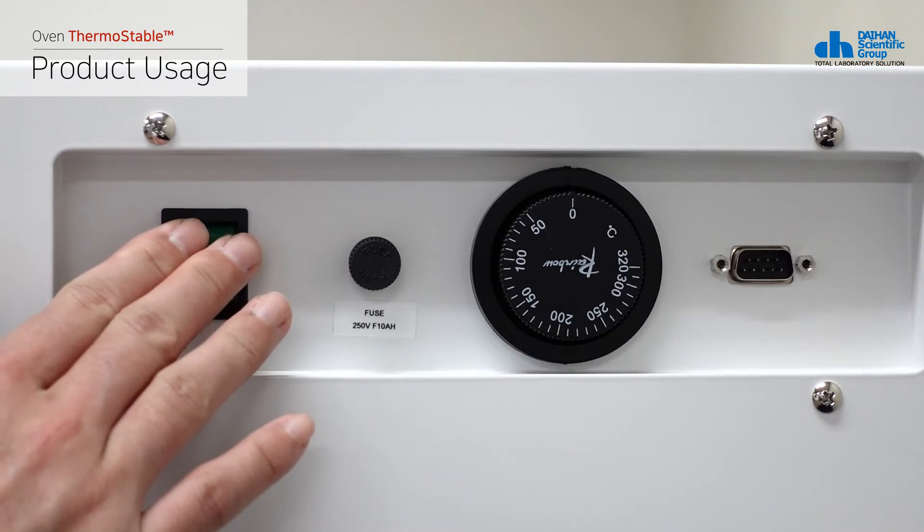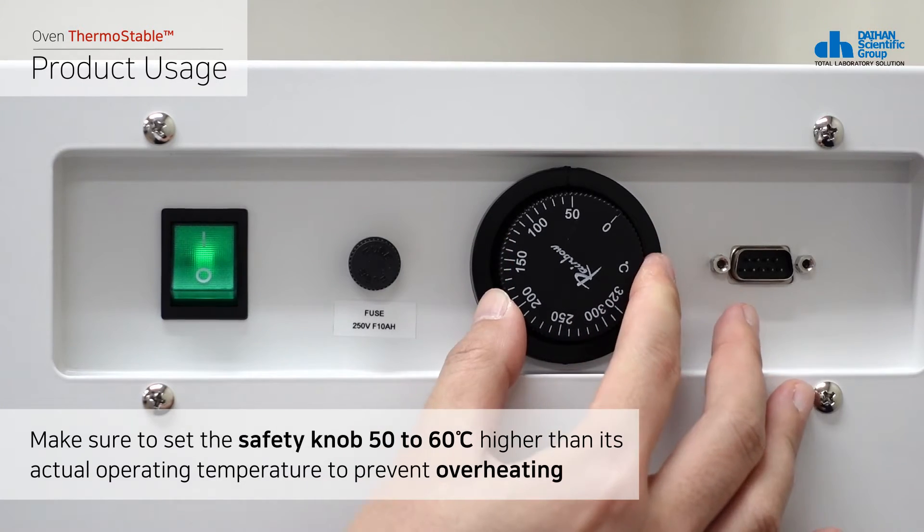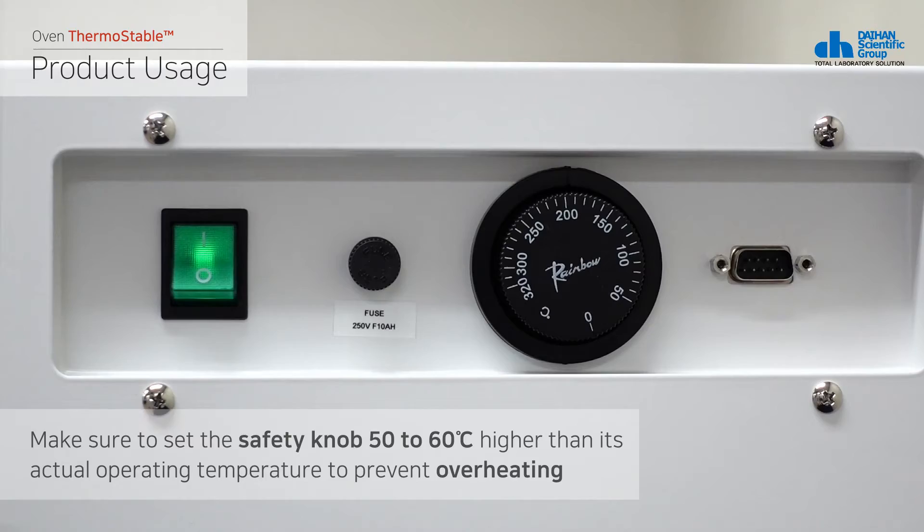Turn on the power switch. Before operating the product, make sure to set the safety knob 50 to 60 degrees Celsius higher than its actual operating temperature to prevent overheating.